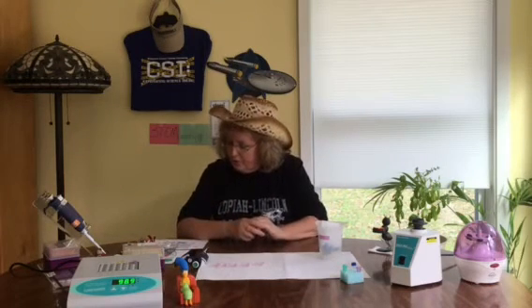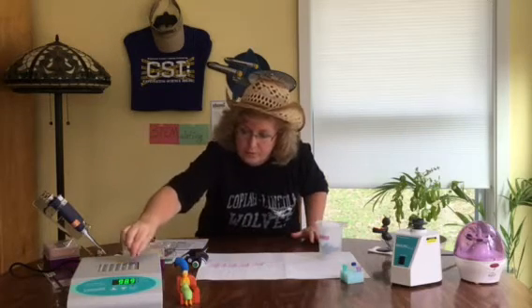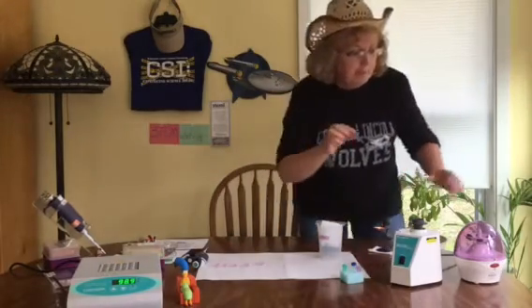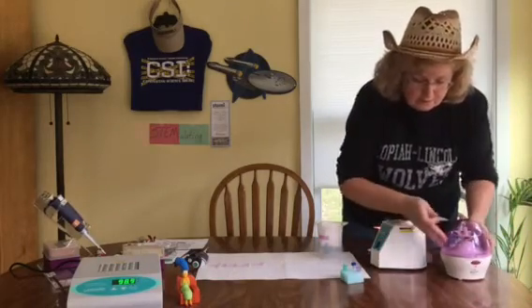Okay, and after you finish labeling, let's pretend 10 minutes are up. After removing the tubes, we're supposed to take them and place them in the microcentrifuge. Well, I only have one. Let's get that vortex out of the way. Here we go.